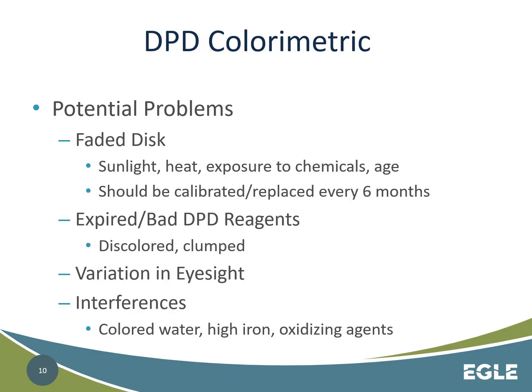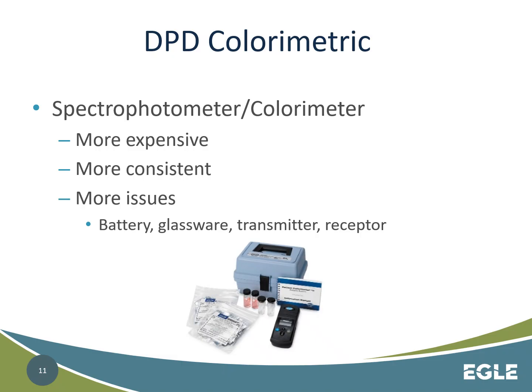And then oxidizing agents. Water that is high in oxidizing agents will react when reagents are added and can mess with the tint and the reading of it. Another thing too is, do we have expired reagents?